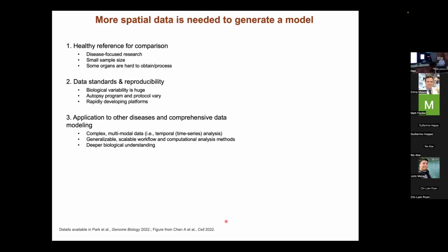And I don't have to tell you guys that someone who's dead for 2 days, the tissues might not be robust. Even in rapid autopsy programs, when you see that in a paper, a rapid autopsy means generally done within 48 hours. Really rapid is in 24. And just to give you an idea, organs like the liver are profoundly abnormal with basically any ischemic time.